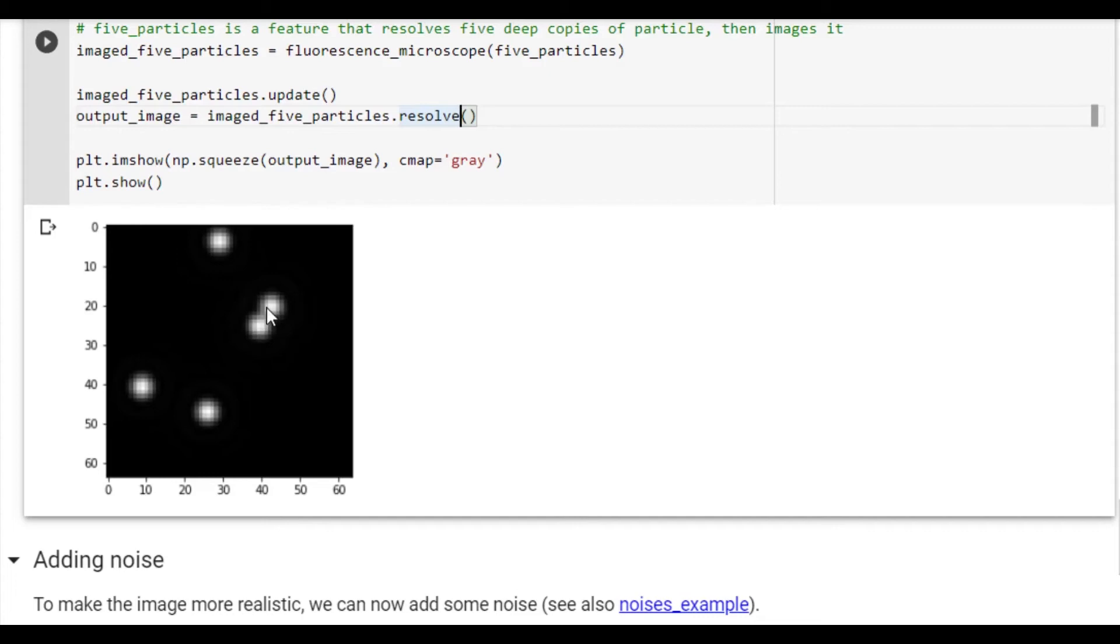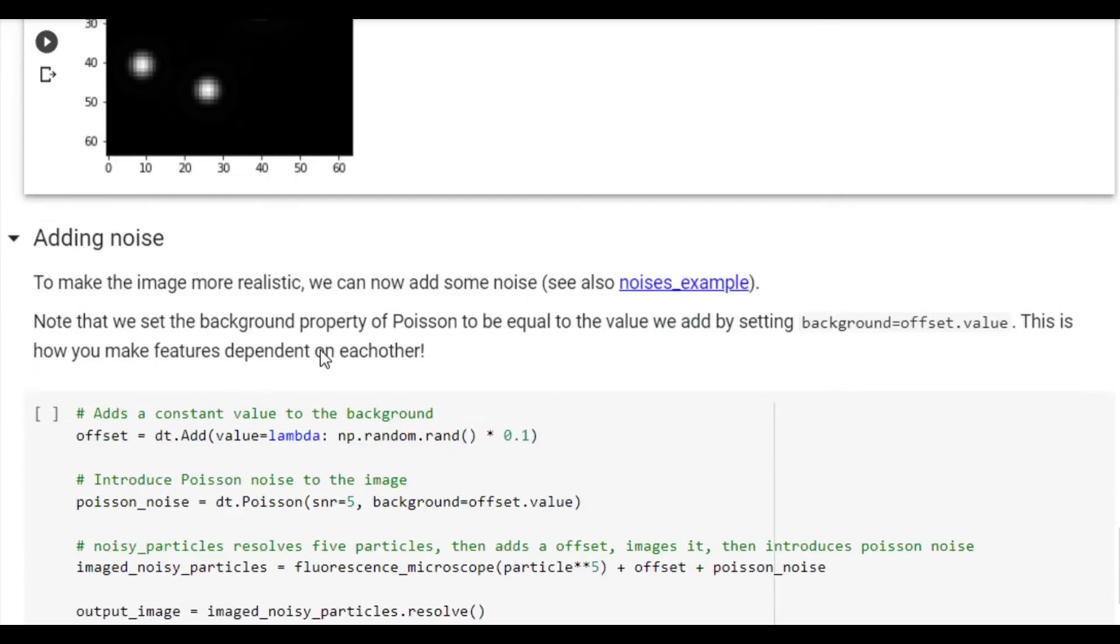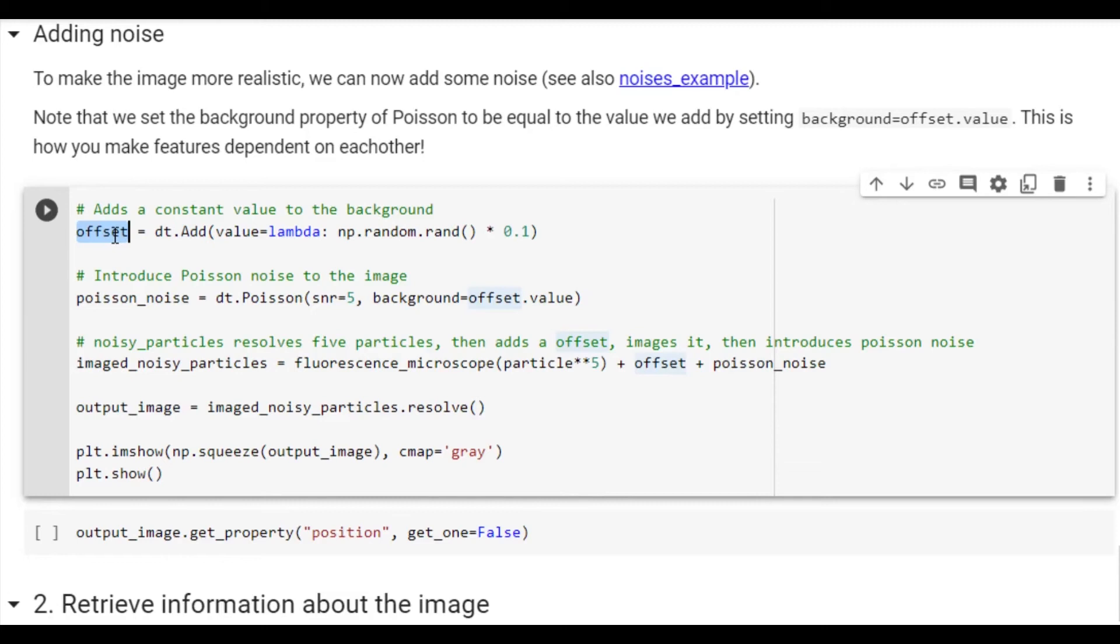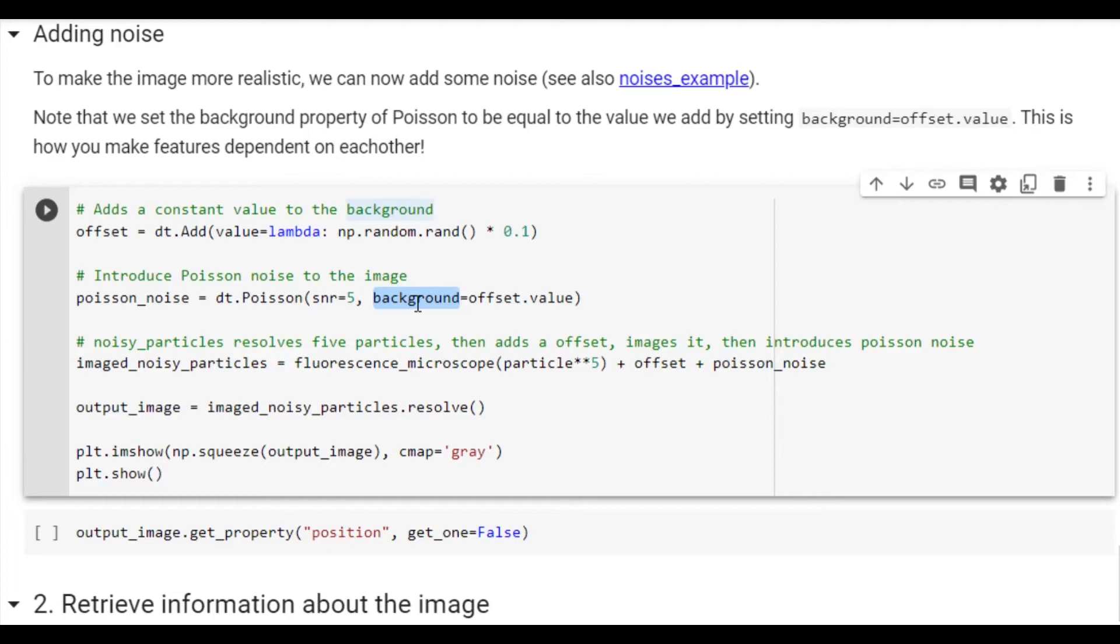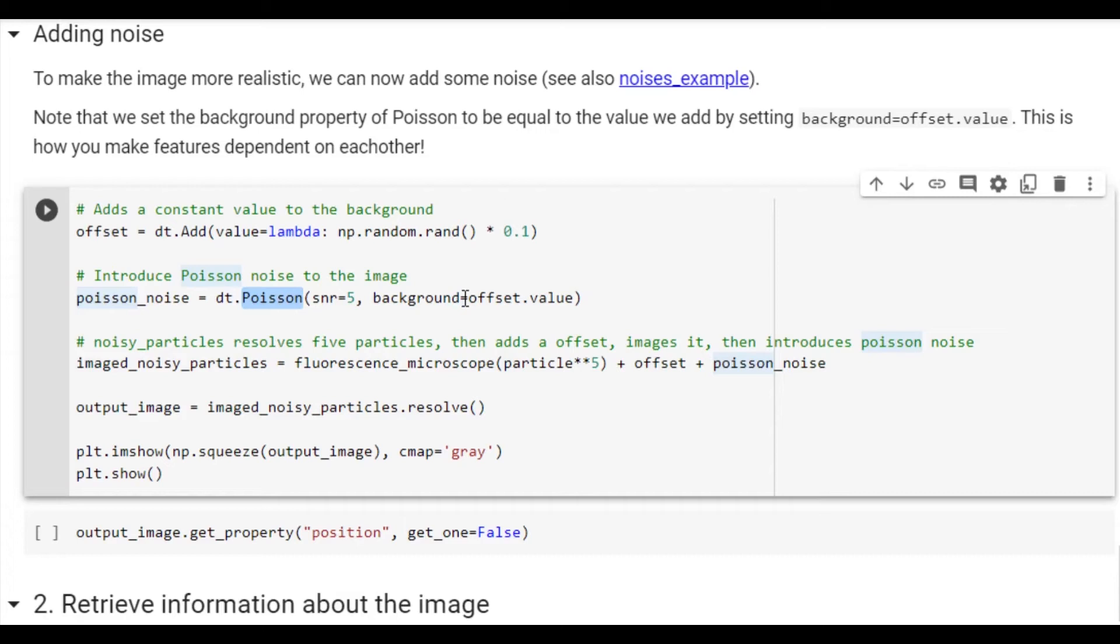In order to make the images more realistic we also want to add noise. As such we will define two more features. One which is the add feature, which simply adds a constant background which can be seen as a background illumination, as well as Poisson distributed noise with a signal-to-noise ratio of 5. For the Poisson feature to determine the signal-to-noise ratio it needs to know the background intensity of the image. However, the background is randomly added by the feature offset.